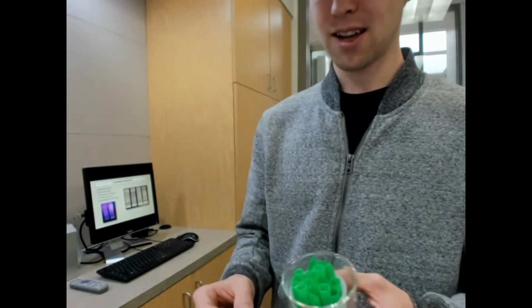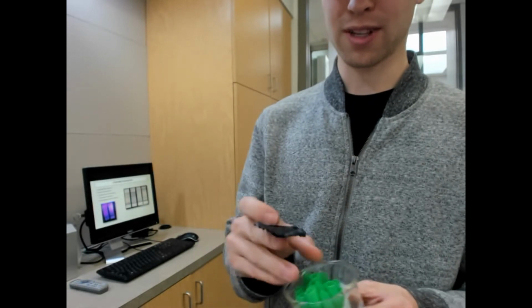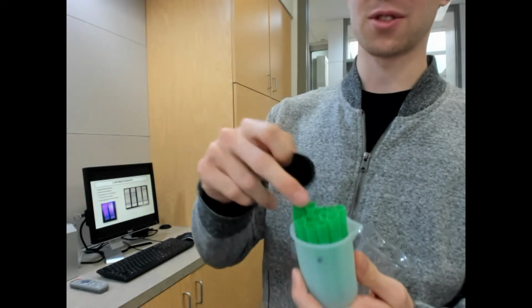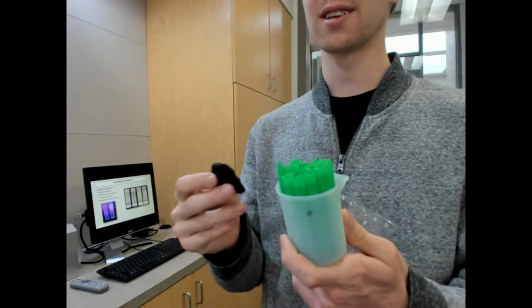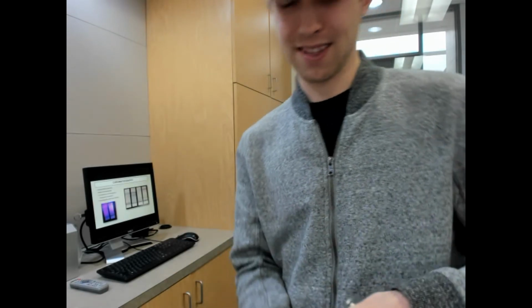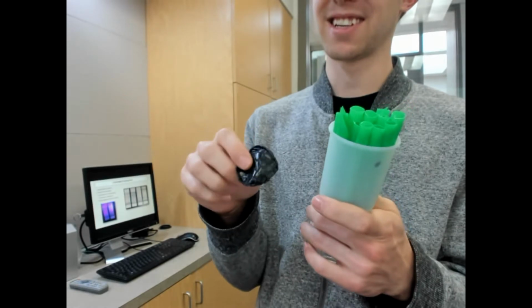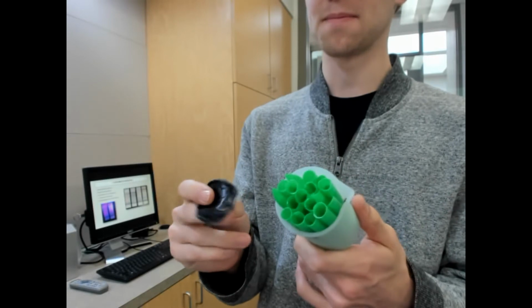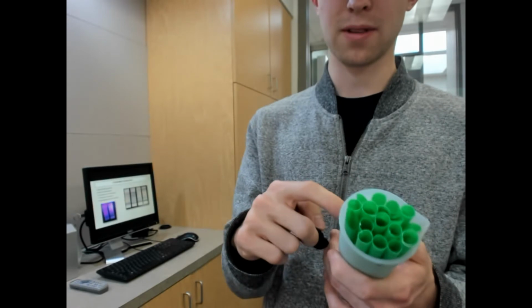Okay, we were trying to find a way that we could test the rubber cement. So we tried to put it in these straws in this beaker, and have the straws be filled up a little bit with the rubber cement, and then it would dry. We've done this before with urethanes and other things, and it didn't work. It just went to the bottom. The straws actually have to go all the way to the bottom, and you need to put enough in there so it gets up into the straws. It needs to fill up a quarter inch deep minimum.